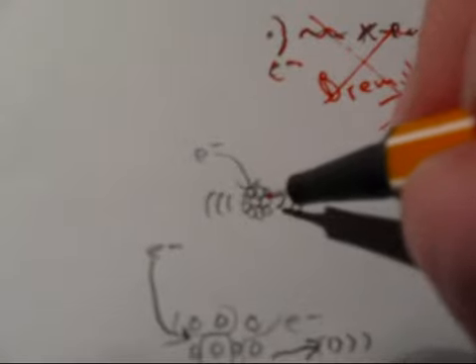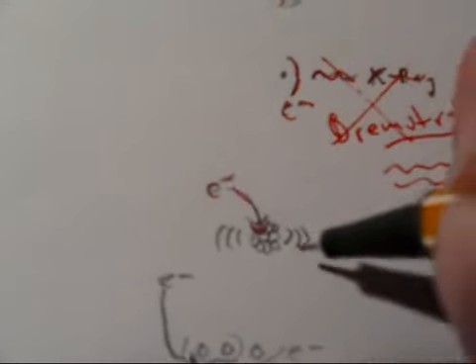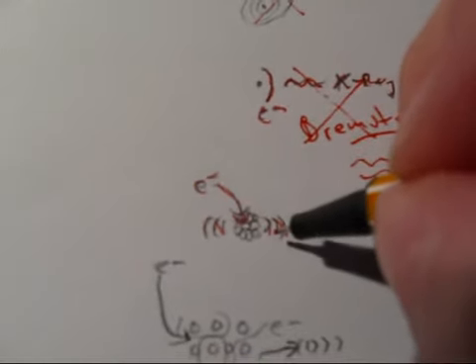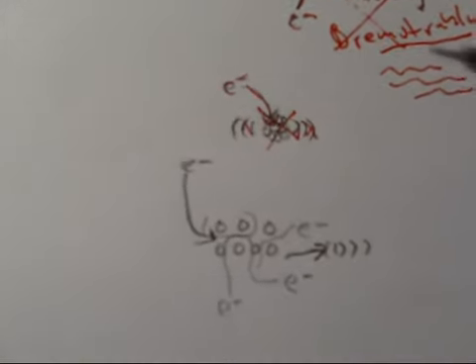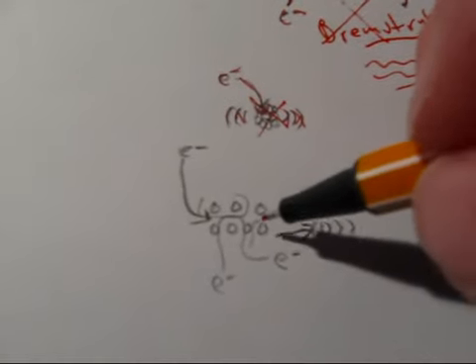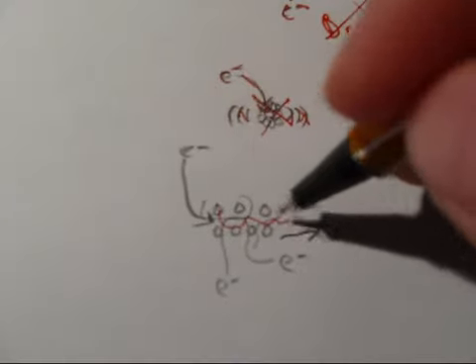What might also happen is that the electron actually sort of excites the atoms, so they begin to vibrate. And this will actually be, as you probably know, heat. So the electrons may actually heat up the sample, but this is not useful for analysis either. Or if you've got a conductor, a semiconductor, you know that in metals they conduct because they have free electrons, so they're just traveling around in the metal grid here.